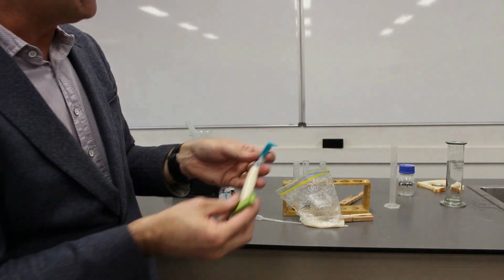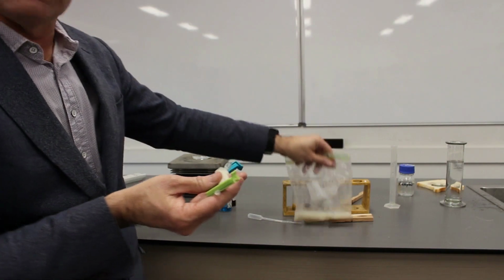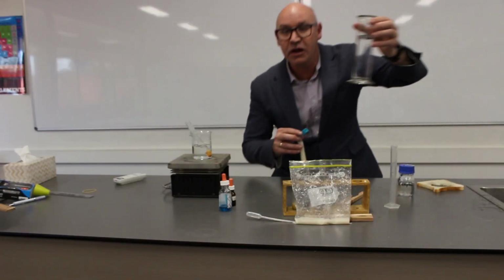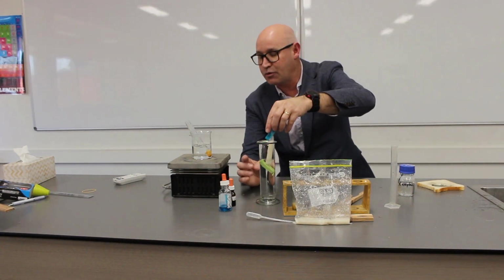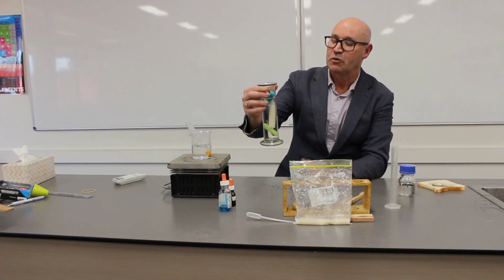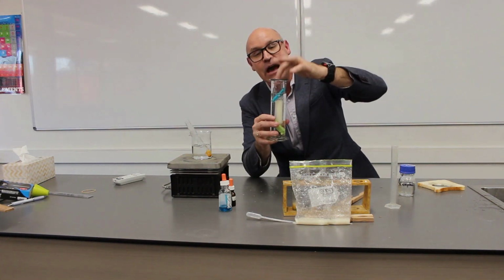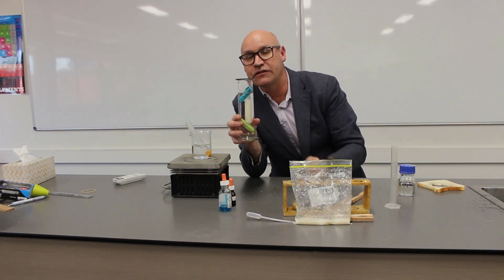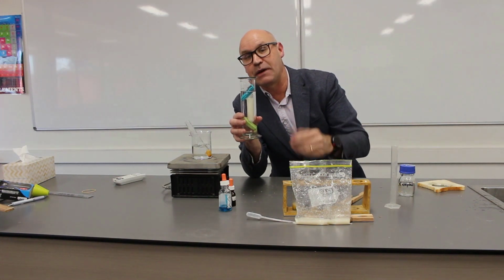What's a good idea is to just give this a rinse, because we don't want any of our bread solution on the outside of our tube. Give it a rinse, and then we're going to put it in a jar or a beaker for around about 24 hours. Okay, and then we're going to come back tomorrow and we're going to test the water on the outside of the tube, testing it for starch and testing it for glucose. So we'll do the starch test and the glucose, the Benedict's test.